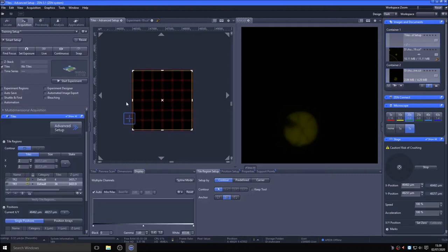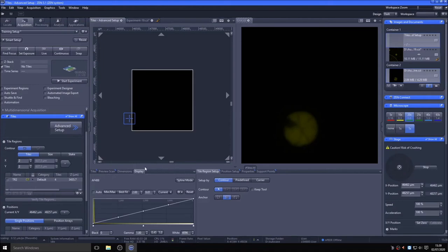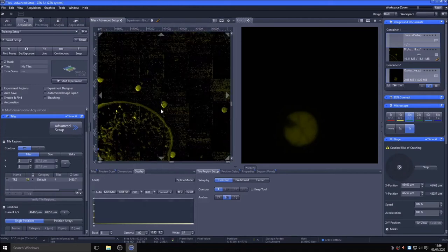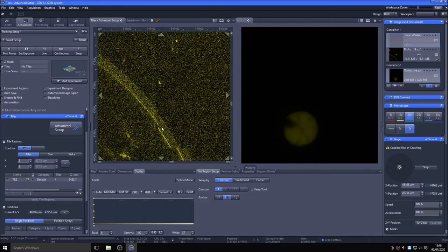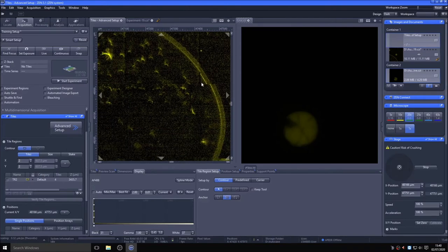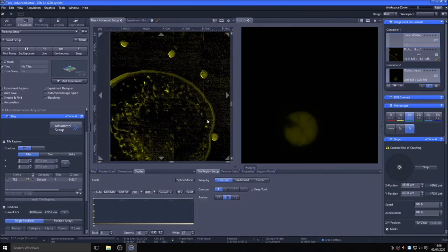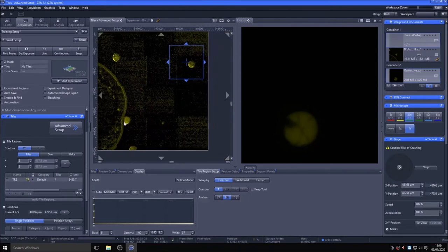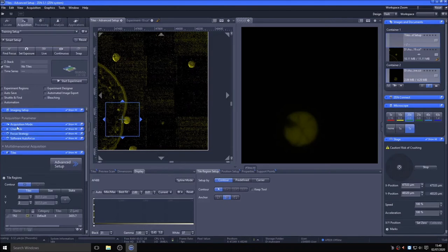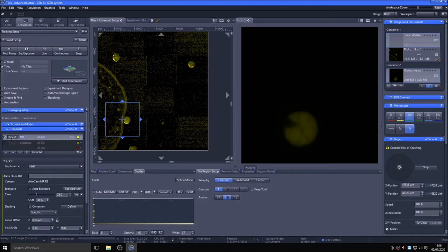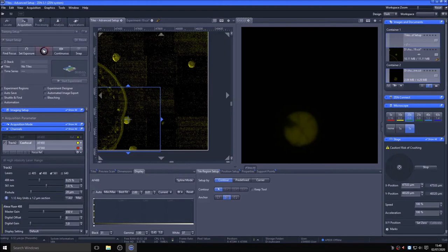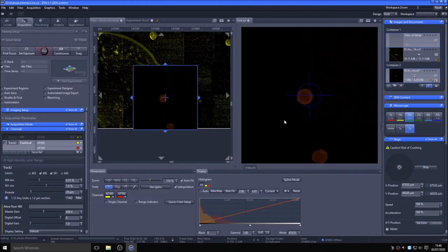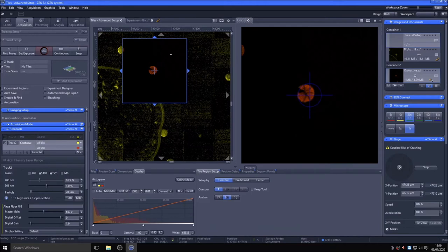The image quality, as you can see here, is poor, and the stitching isn't even particularly good. But the image does not necessarily have to be great but merely act as a positional map. As you can see, if I now switch back to the confocal track, you can navigate around the preview image and move to the region of interest much more quickly than you would if manually searching around the sample.